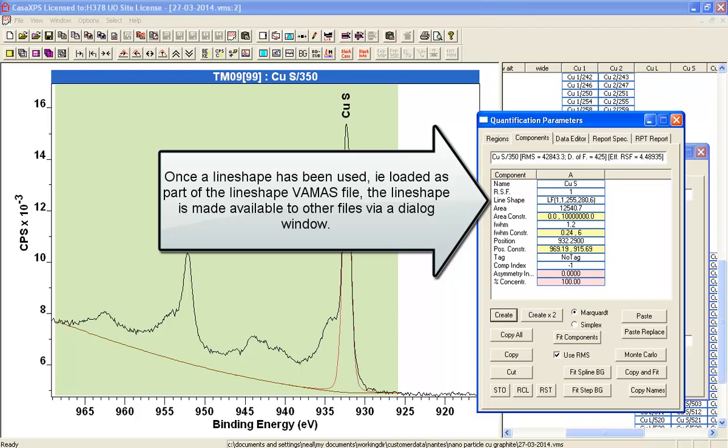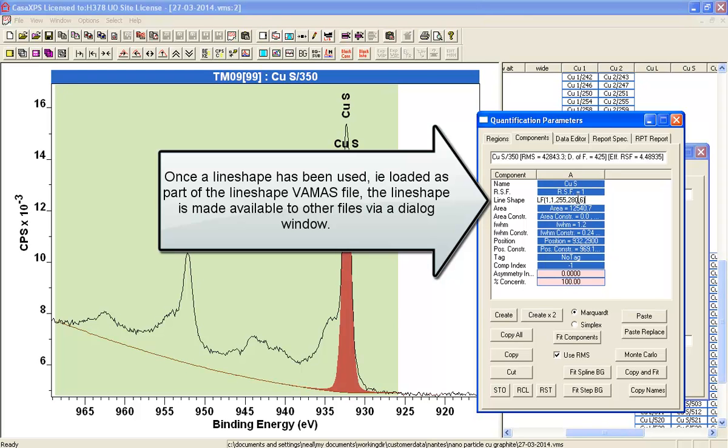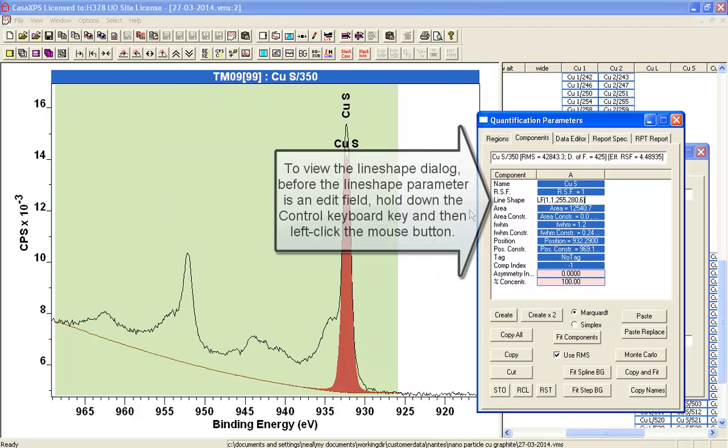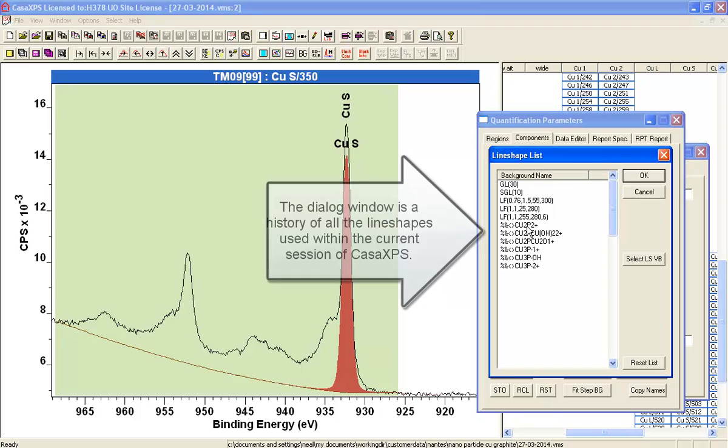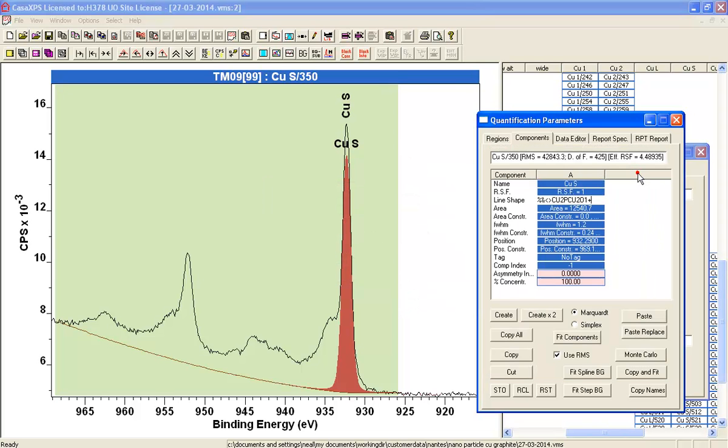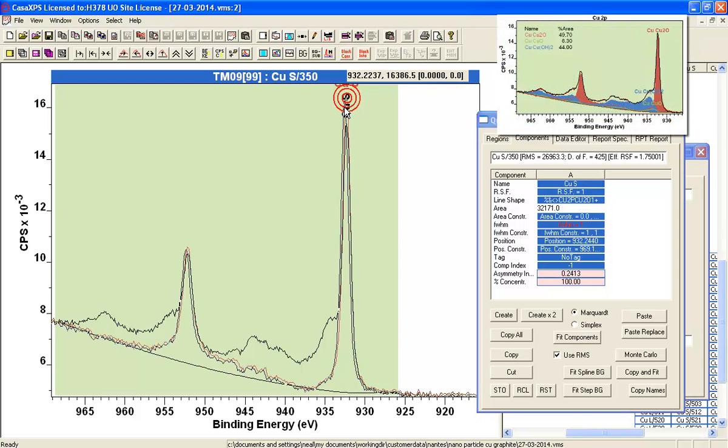And the first thing I've done is I've created a peak, and it's brought in a line shape, but it's not the one from the library. So I want to hold the control key down and click before the edit field. And this shows me all the line shapes that have just been loaded from the library file. So the first one I'm going to put in is going to be the Cu1+. And I'll just say Fit to that. And you can already see that Cu1+ is a significant part of these data.